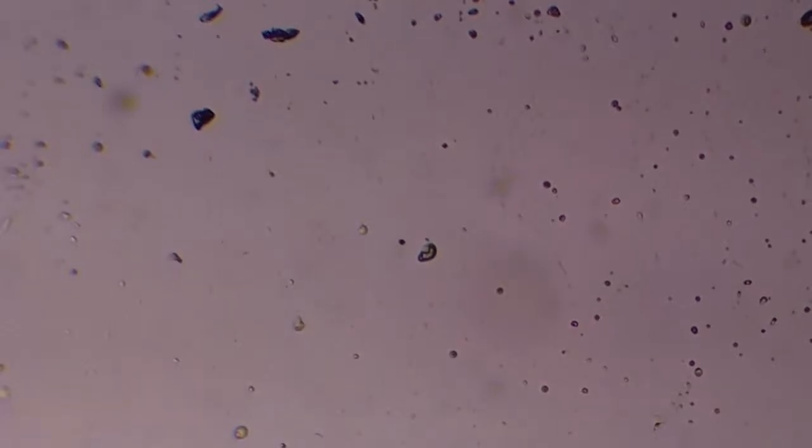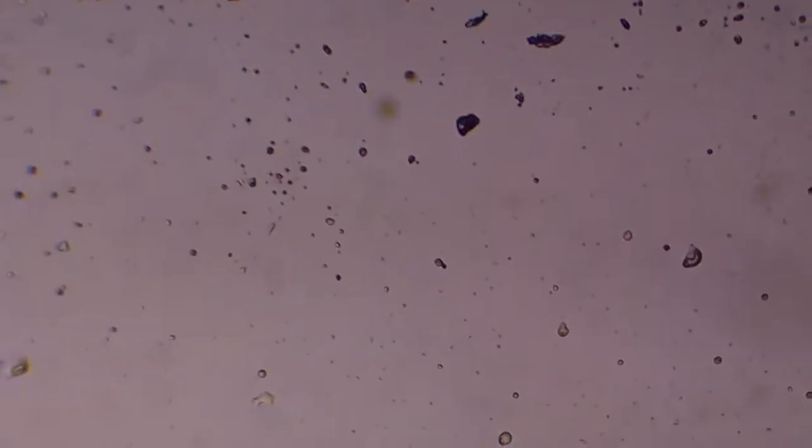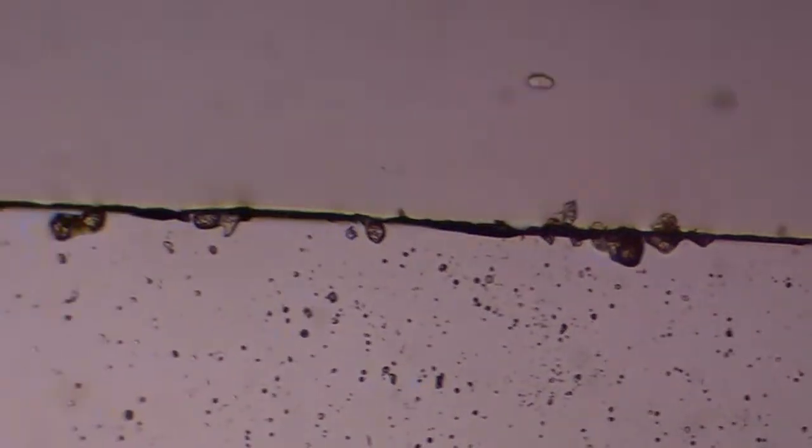Just checking to see if this other profile is actually working here. I did see something swim by a little bit ago. Oh, there's a little guy over there. This is a sample of water from Tenaya Lake in Yosemite just a couple days ago.